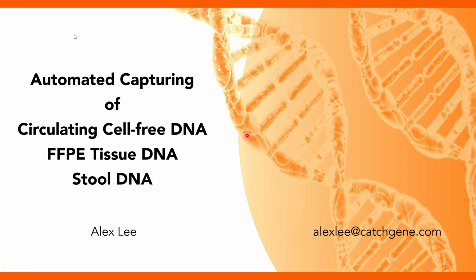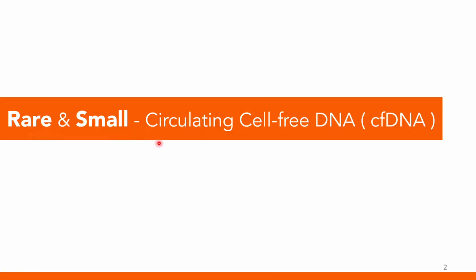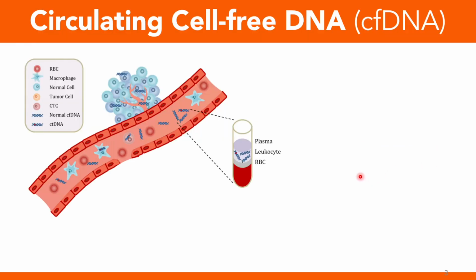In my part, I'm going to introduce automated capturing of circulating cell-free DNA, FFPE tissue DNA, and stool DNA. Okay, let's move to the first topic of my presentation, rare and small circulating cell-free DNA.